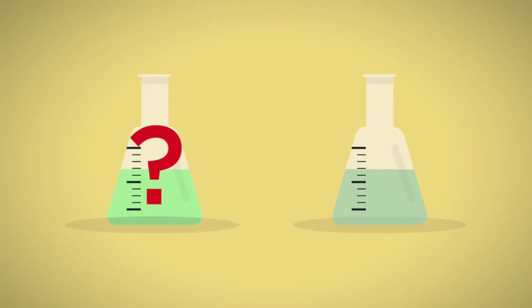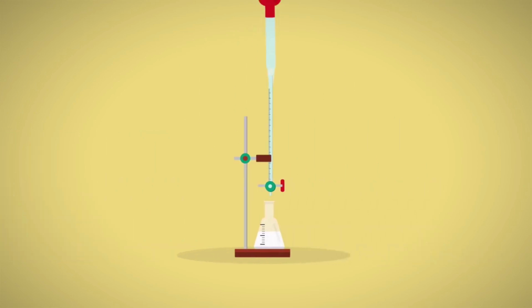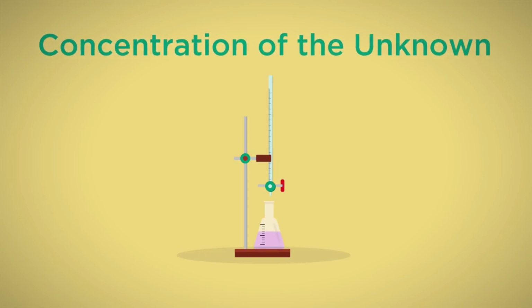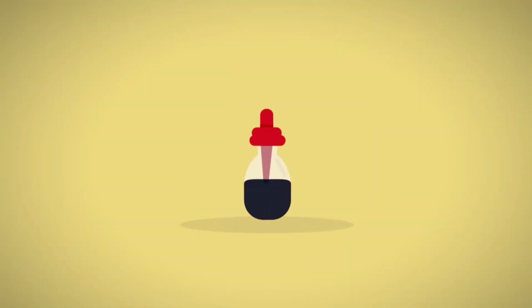Hello and welcome to today's lesson. In today's lesson we'll learn how to carry out titration and also calculate the concentration. Okay, now this video I put in here is going to explain the titration process and also the calculation process. All you need to do is just to pay attention and follow suit.